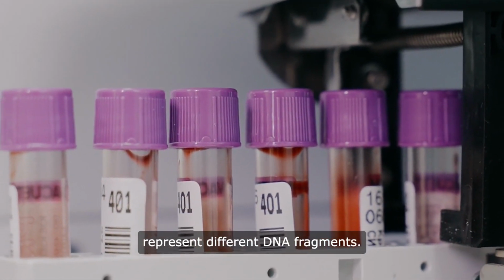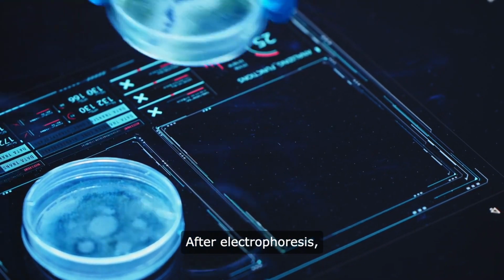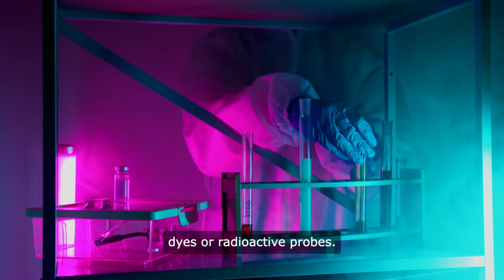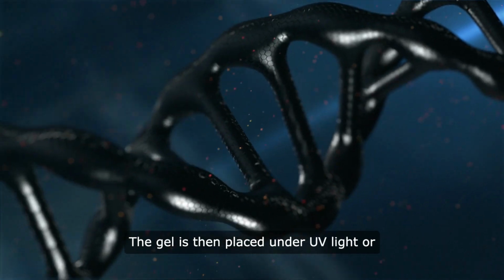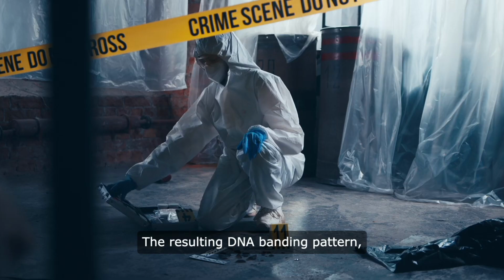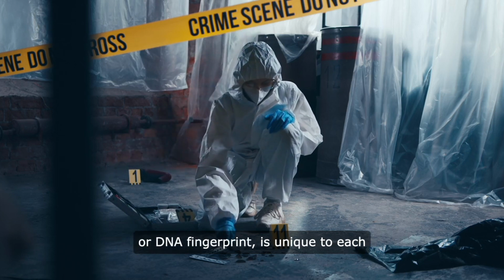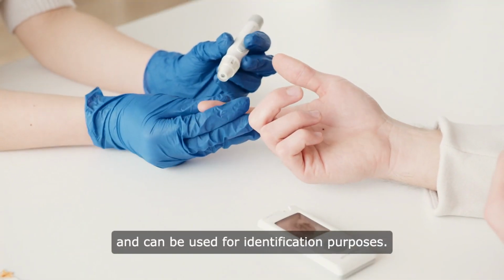Staining and visualization. After electrophoresis, the DNA fragments in the gel are stained with fluorescent dyes or radioactive probes. The gel is then placed under UV light or X-ray film to visualize the DNA bands. The resulting DNA banding pattern, or DNA fingerprint, is unique to each individual, except identical twins, and can be used for identification purposes.